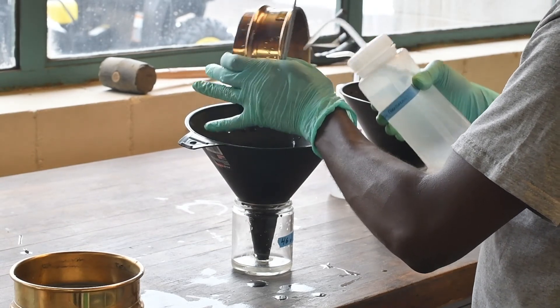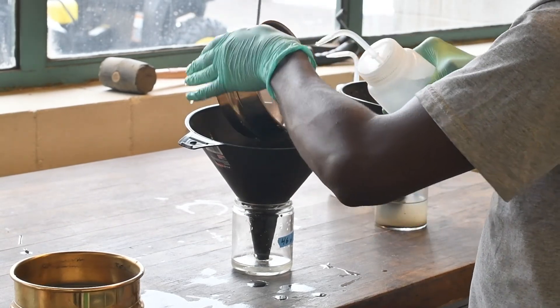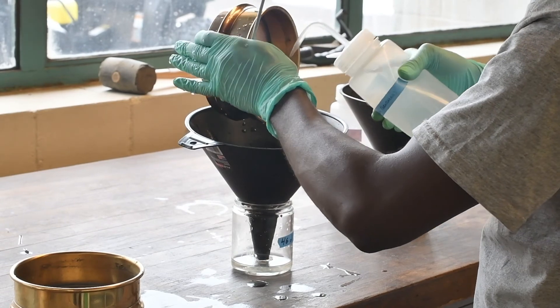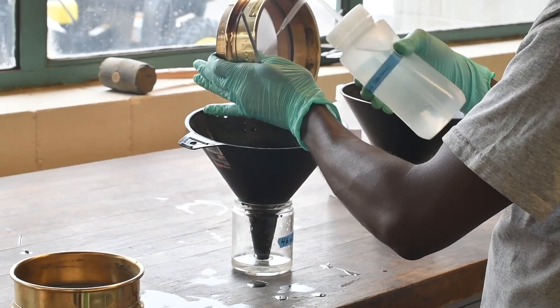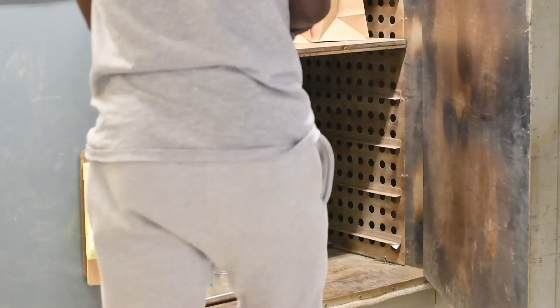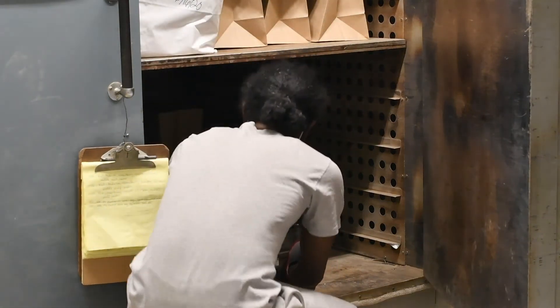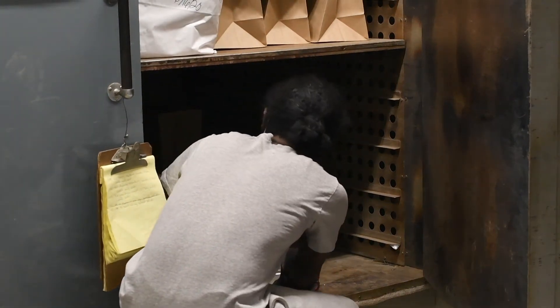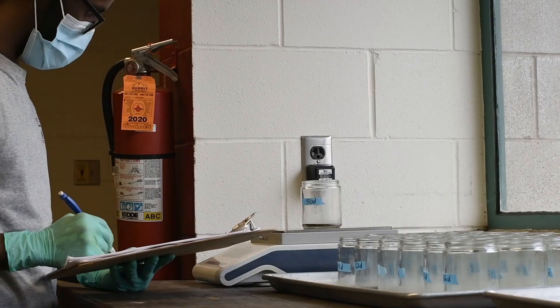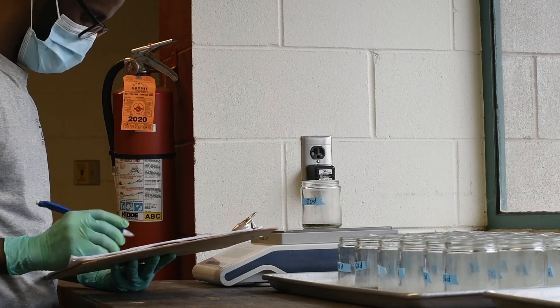Like before, use the wash bottle to rinse all particles back into the same jar it came from and return it to the oven to dry. When the sample is dry, remove it from the oven and again return it to room temperature. Then, like before, weigh and record the mass of the sample.